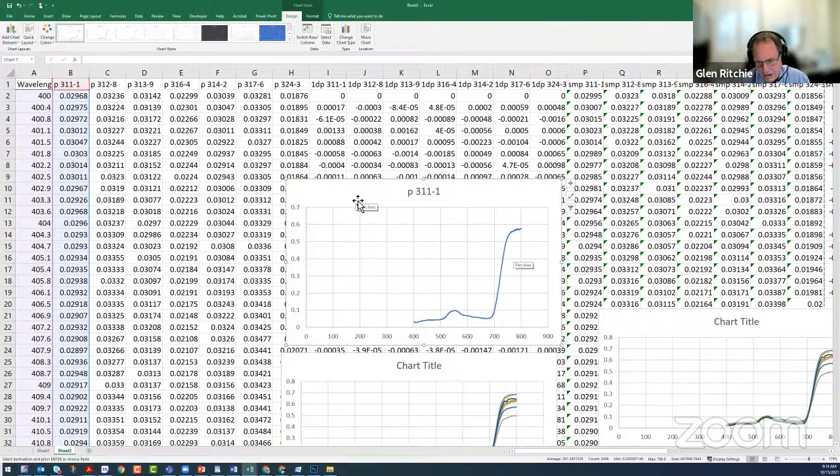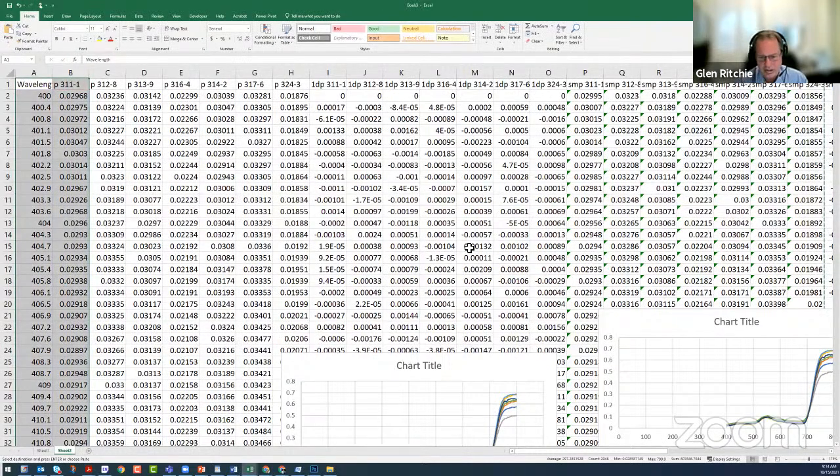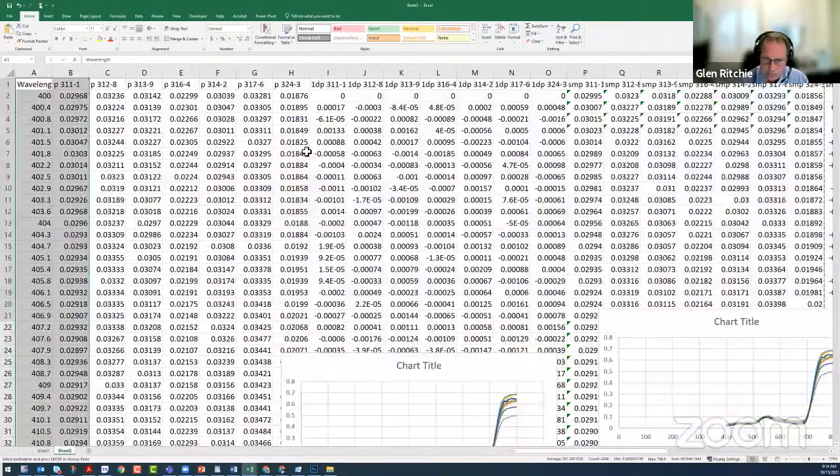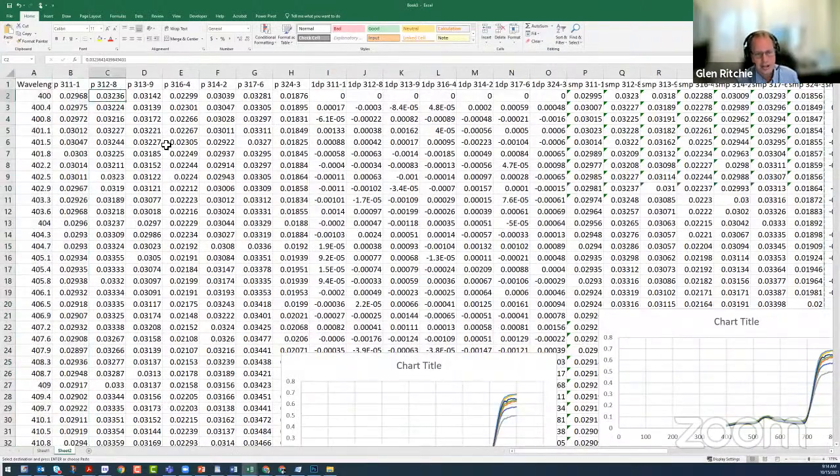No big shocks here. A lot of times we'll focus on this range and this range to get NDVI, and you can get an estimate of how big the plants are or how green the plants are. You can also do some more involved measurements, such as looking at what's going on between individual narrow wave bands here. One of the ways that we do that is by doing derivative measurements.